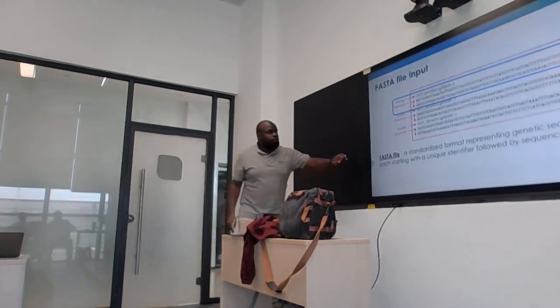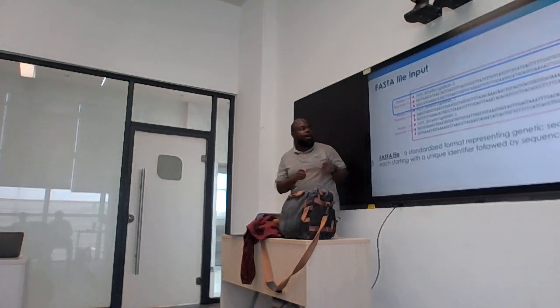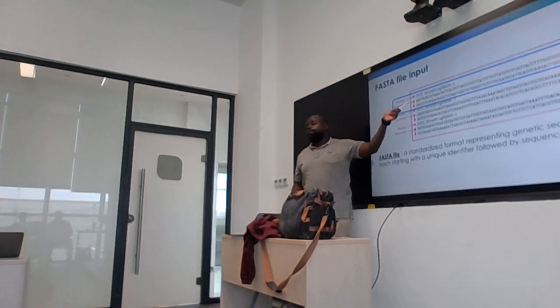All right. I also just wanted to show a FASTA file which only has a header and the sequence, no quality information.